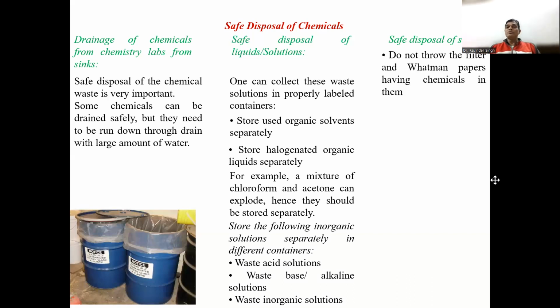How can we do the safe disposal of solids? Never throw the filter paper or Whatman paper having chemicals on it in the dustbin. Put them in a pit for biodegradation.